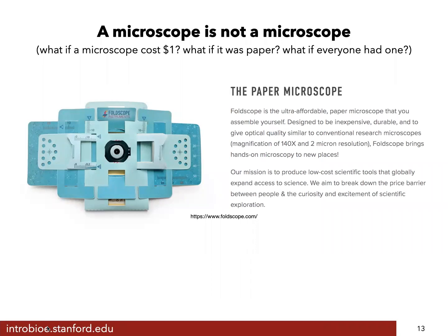Now, this microscope is an optical microscope. And so visible light will be the source of radiation that you use to see things. And so that means the lowest wavelength is going to be about 400 nanometers, right? So you'll be able to see things on the order of a micron, a little bit less than a micron, and a little bit bigger than that.